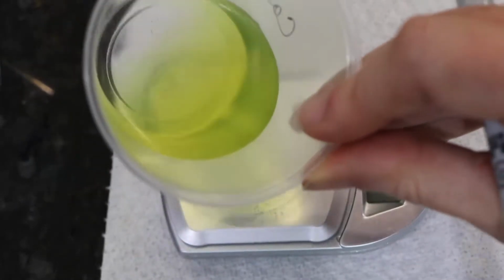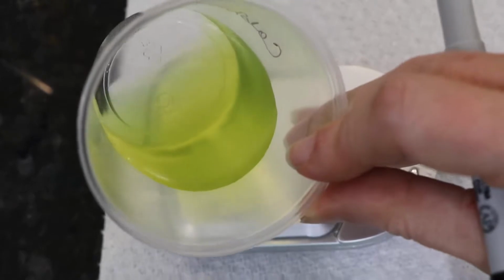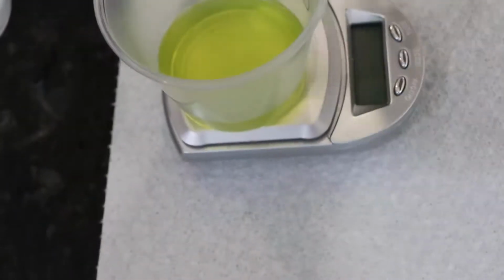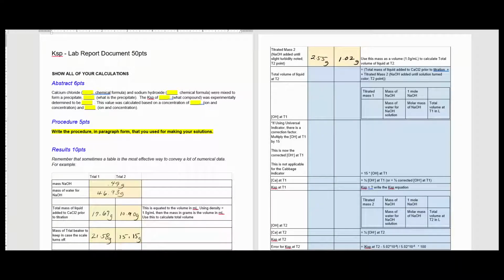And then I wanted to show you, after this had sat for a minute or two, you see how yellow this solution looks in comparison. And you can tell that it's not quite transparent. And then the purple one, also you can tell, although it's not quite focused, it's not quite transparent. That's what you're looking for.